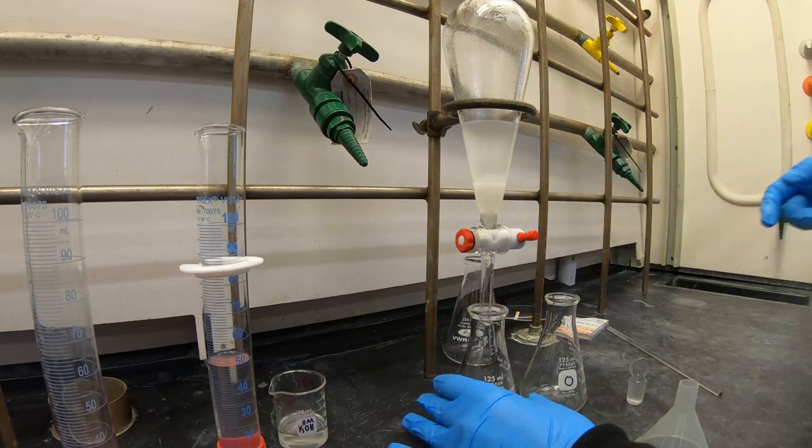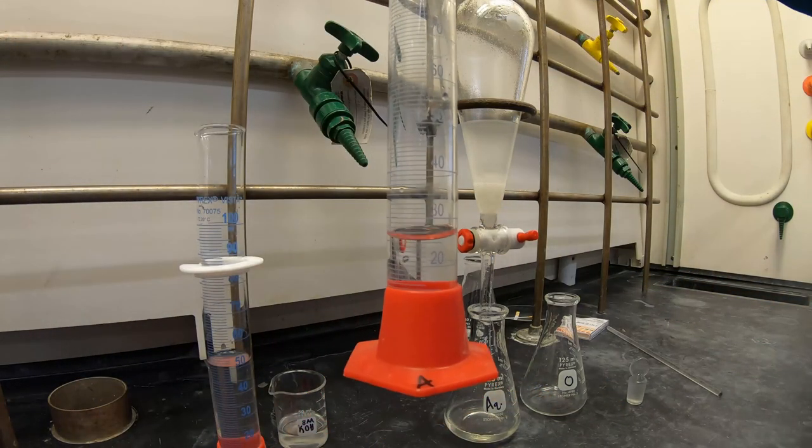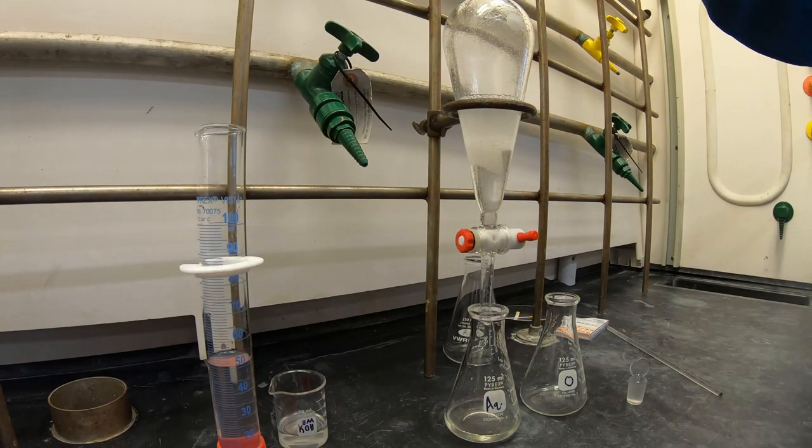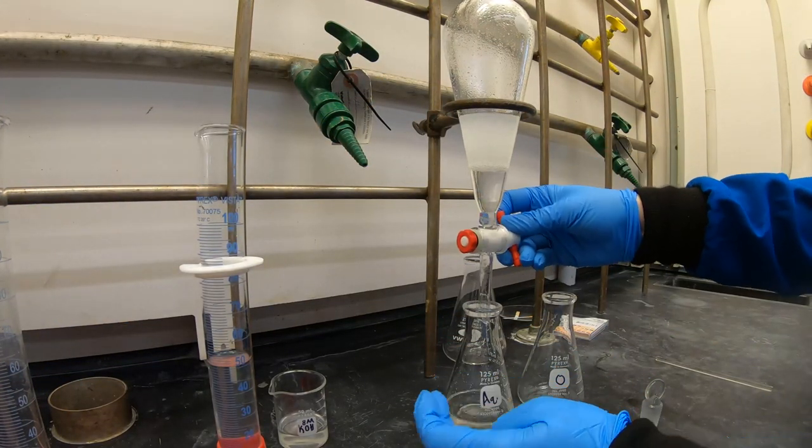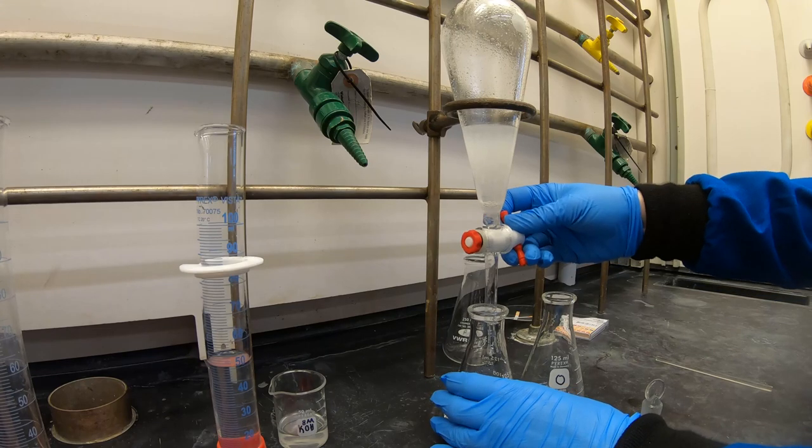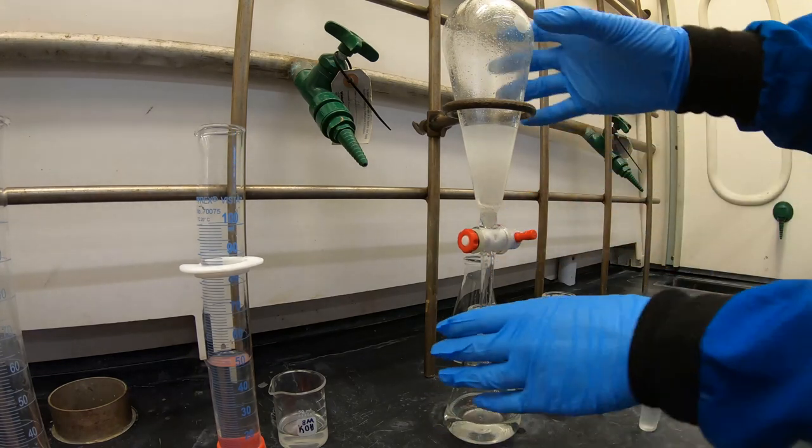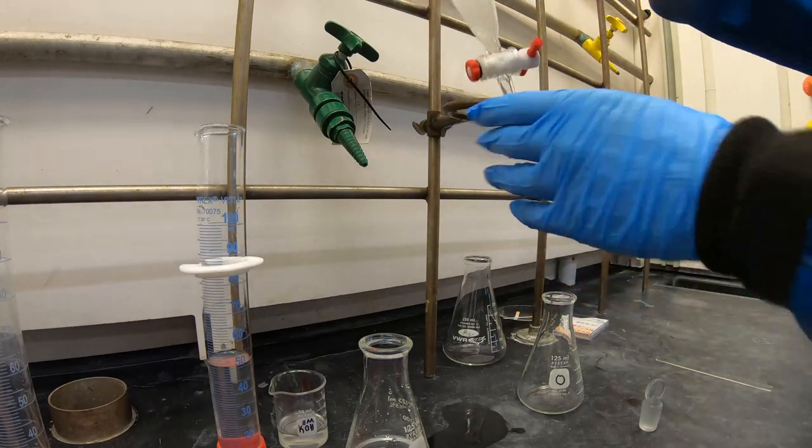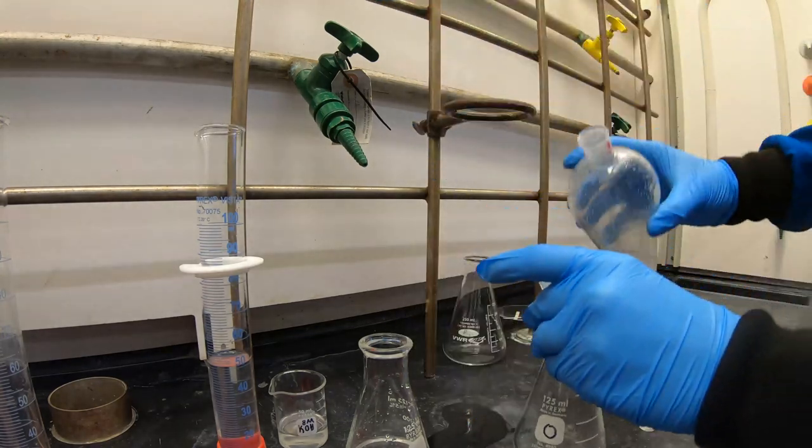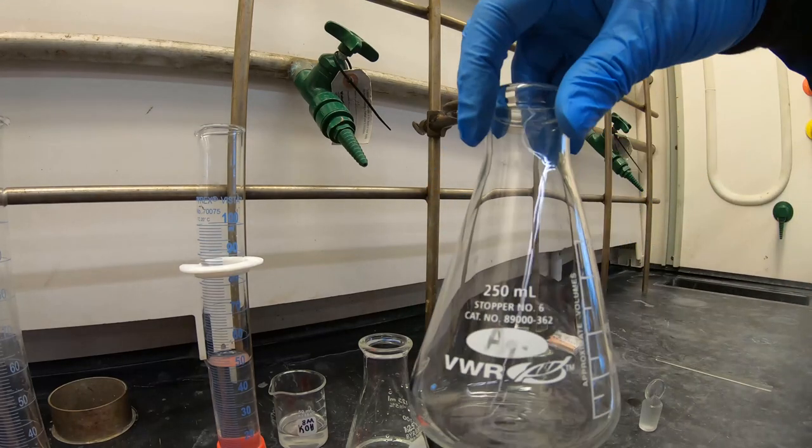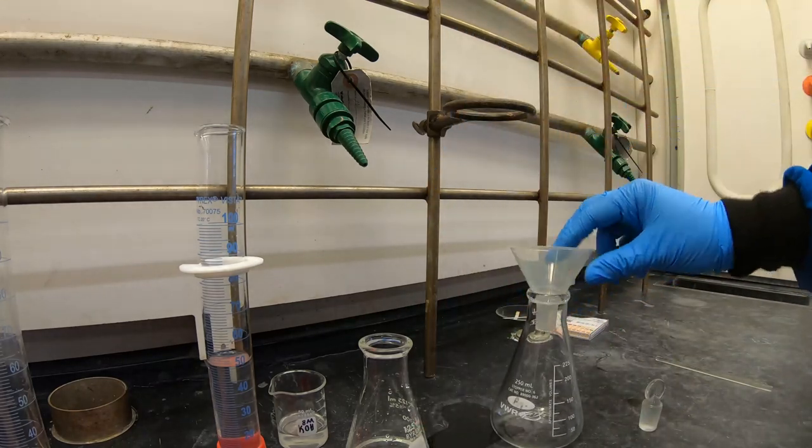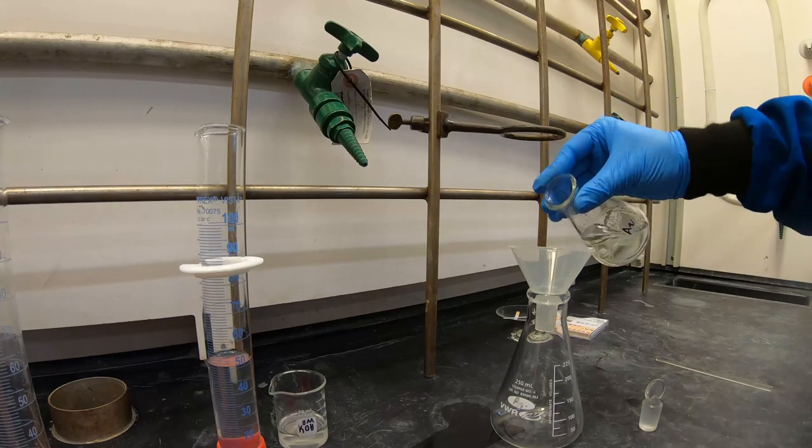After removing the aqueous layer, since toluene is on top, we can leave the organic layer, then add our second portion of HCl directly to the separatory funnel. Transfer your organic layer to its Erlenmeyer flask. Transfer your combined aqueous layers into a 250ml Erlenmeyer flask.